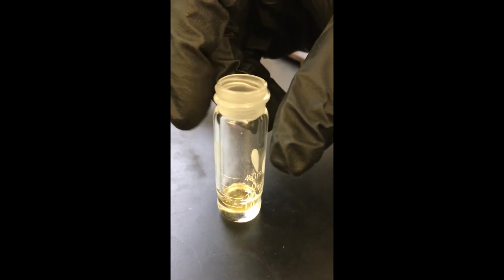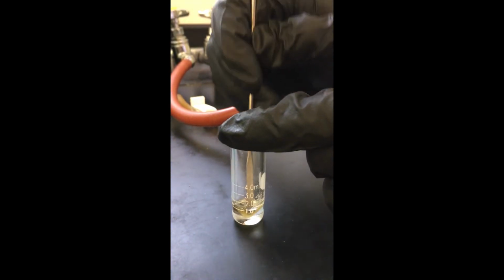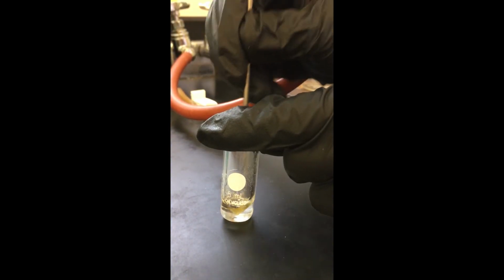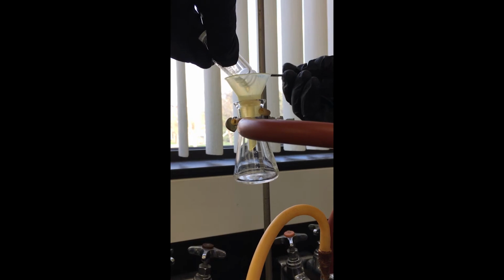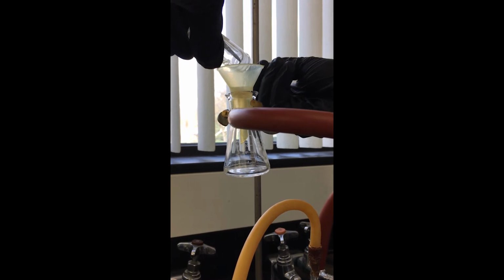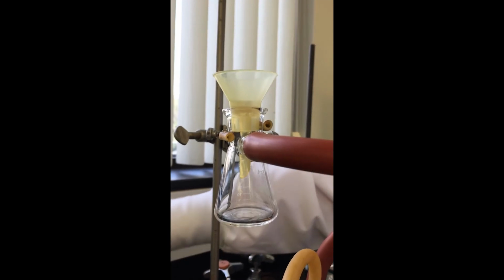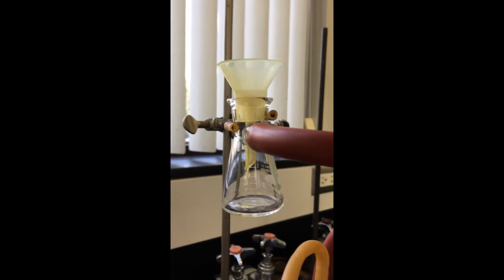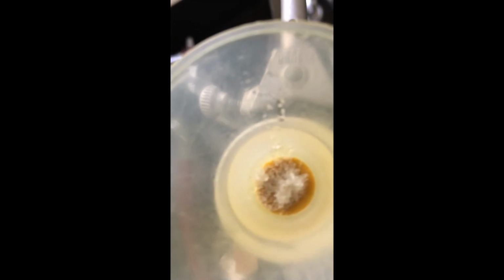So I'm going to collect those via vacuum filtration. I'm first going to gently scrape the sides of the vial to loosen up the crystals so they'll come out. And then I'm going to upend this into the filtration apparatus, making sure that I get all of the crystals out of the flask and into the vacuum filtration apparatus. And then if we look up here, you can see that those crystals have collected nicely on the filter.